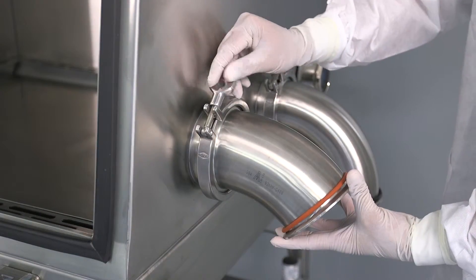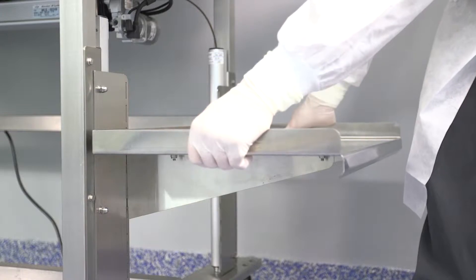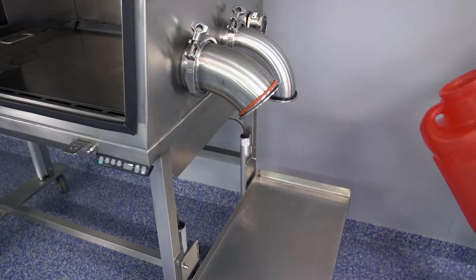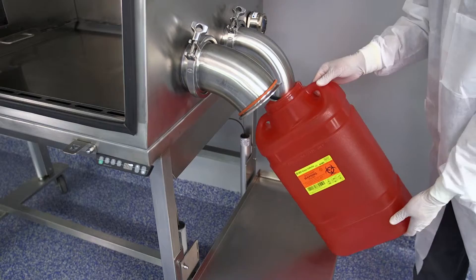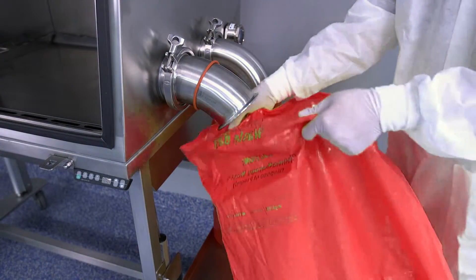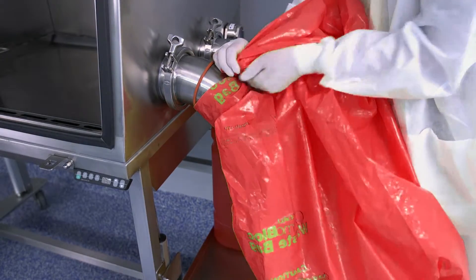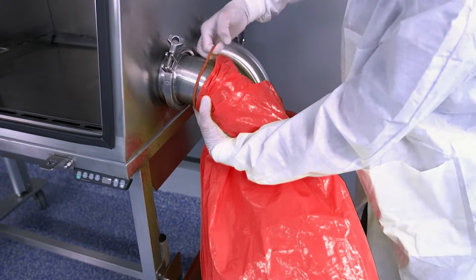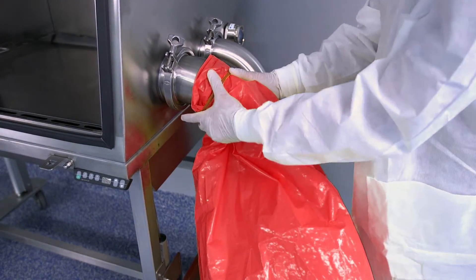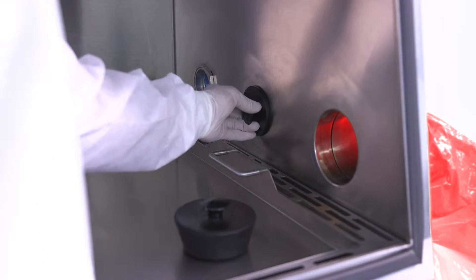Install the larger waste receptacle discharge tube next to the sharps discharge tube. Place the adjustable sharps collector shelf in place. Place the sharps container and the waste collection box on the tray. Secure the waste bag with the O-ring.